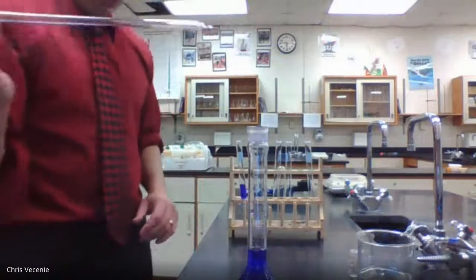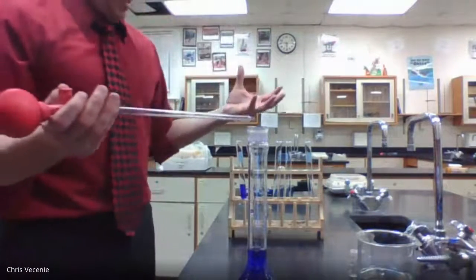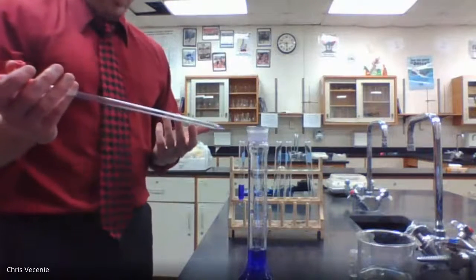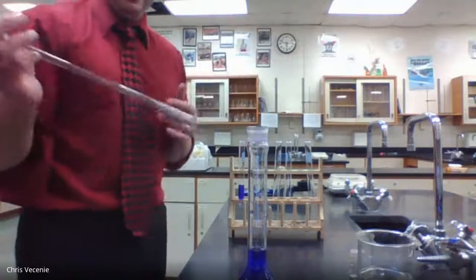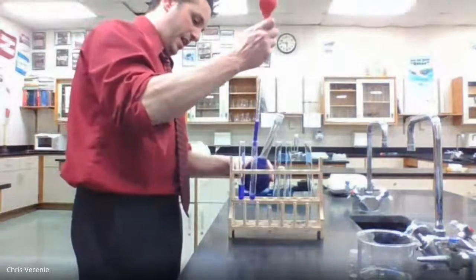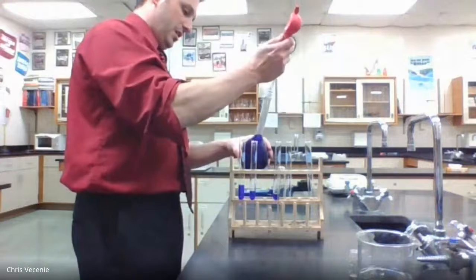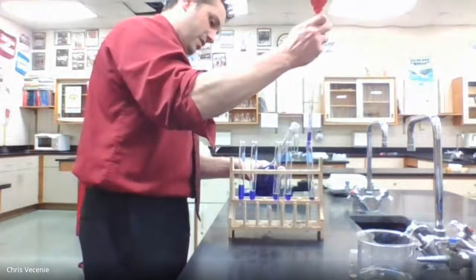What you guys would then do is you would measure out all of the other crystal violets, right? And the 5 milliliters is the most potent, right? Because we're diluting it. That was the 12.5 micromolar. It's going to be less and less and less. All right, so I'm just going to take a little bit less each time. You guys will know the exact values for these, just to get you a feel for what we're looking at. So you guys would have done that and then that. And obviously you would measure these much more accurately, right? But I'm just getting you a visual here. That and that.